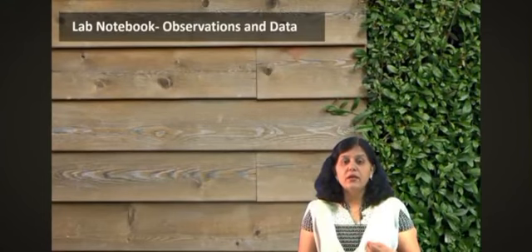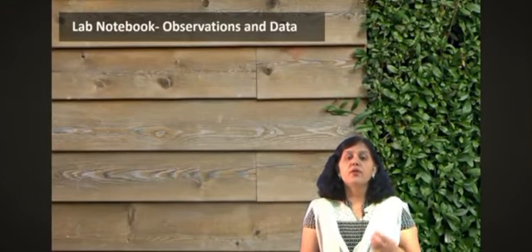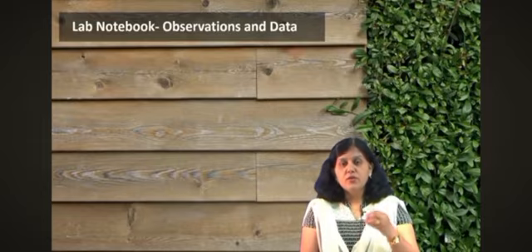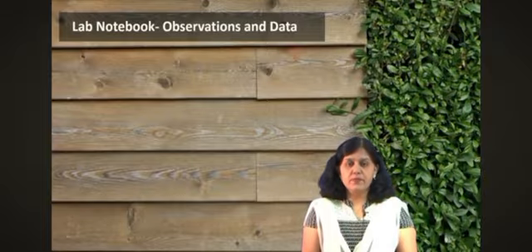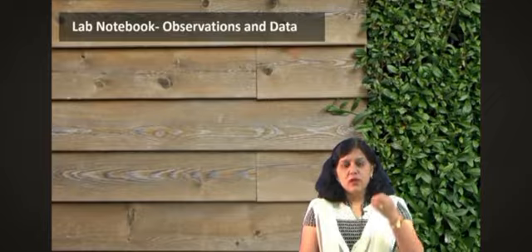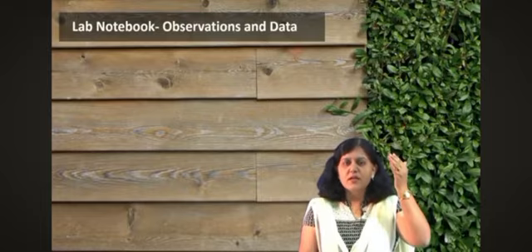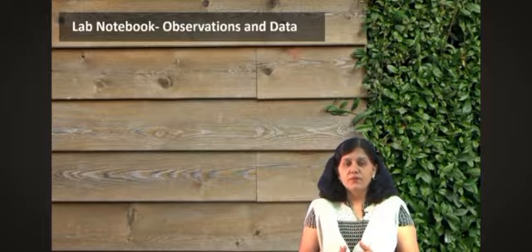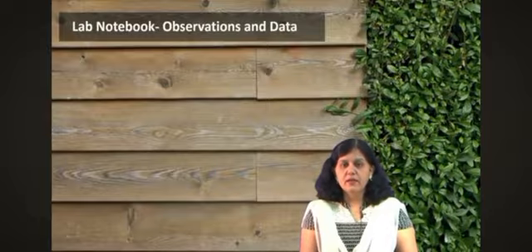Now, how are you going to write your observations, or how are you going to write your data? The observations and results of the investigation should include everything which happened during the experiment. You will not miss anything. Whatever your expectations were, whatever you had anticipated, and what the actual output is, everything should be there related to that observation and data.